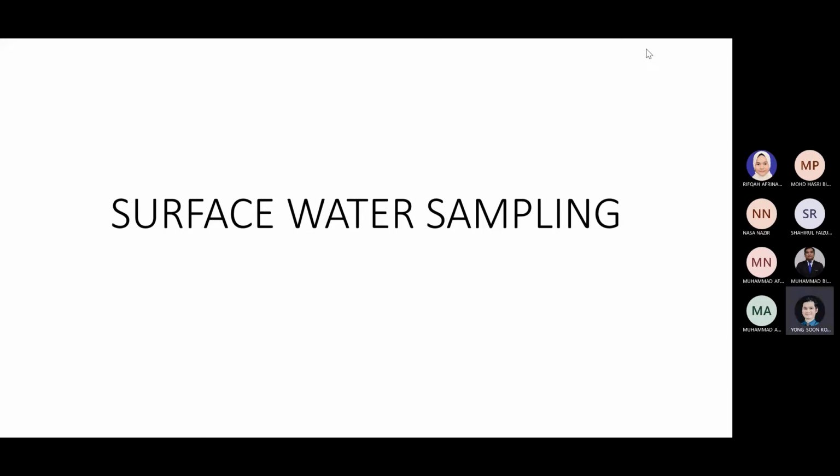And the other one, most importantly, is dissolved oxygen, because the majority of pollution comes when there is not enough oxygen in the water. So regardless of whether it's river water or lake water or maybe marine water, dissolved oxygen is the main parameter to measure the health of a surface water. But what about groundwater?